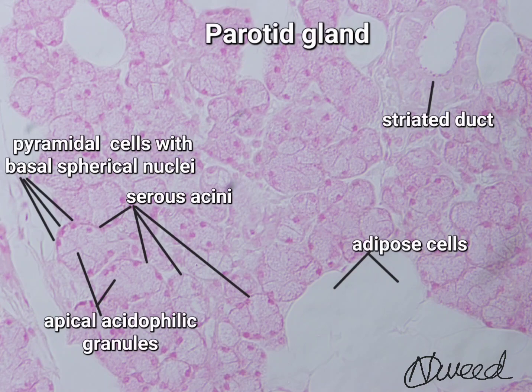The salivary ducts are classified into three types: 1. Intercalated duct, 2. Striated duct, 3. Excretory duct.